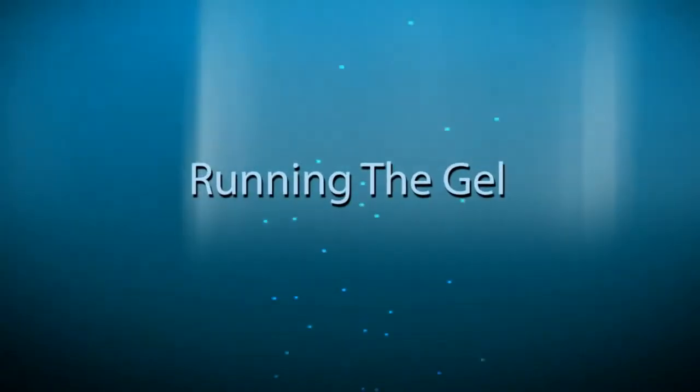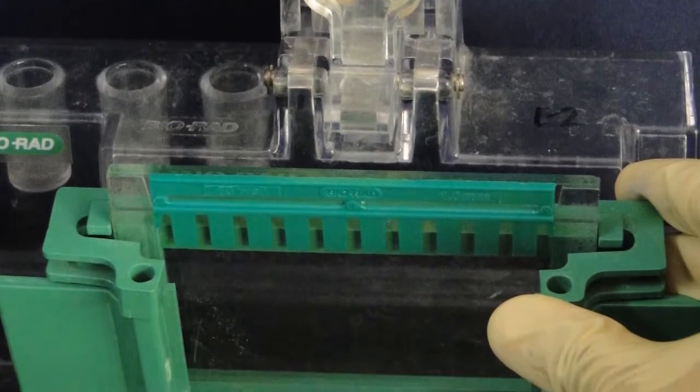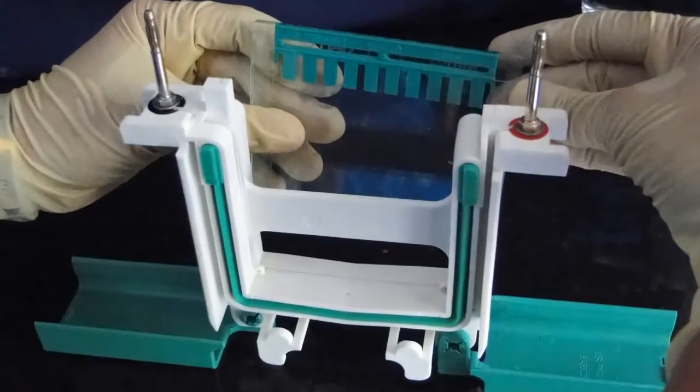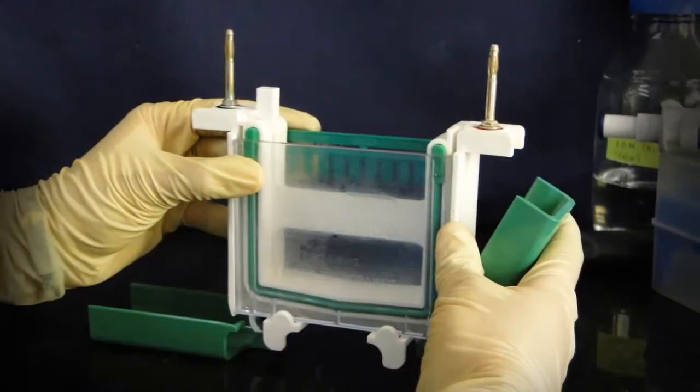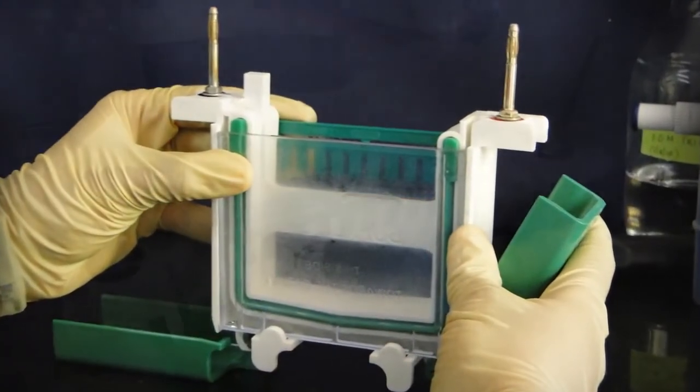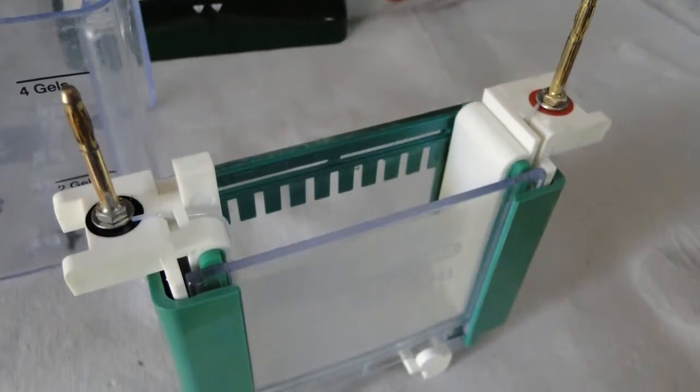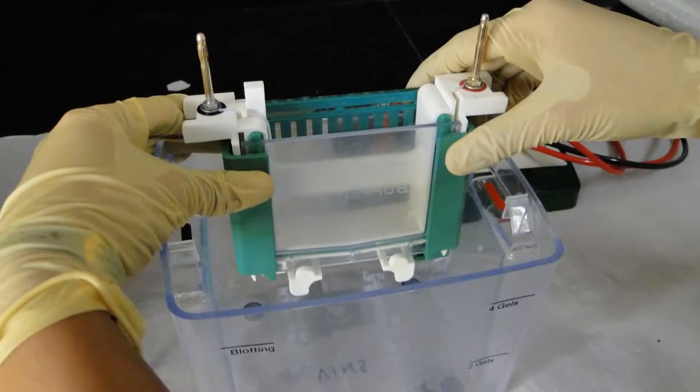For running the gel, assemble the apparatus first. Take out the gels from the casting frame and clamp them in the gel apparatus. Make sure that the short plate always faces inside and if you have only one gel to run, use the dummy plate that is available to balance. Secure the plates, place them in the cassette and lock it. Now place the cassette in the tank.